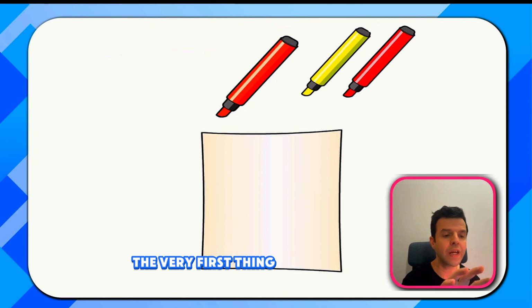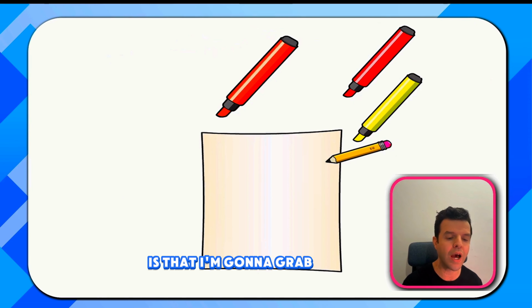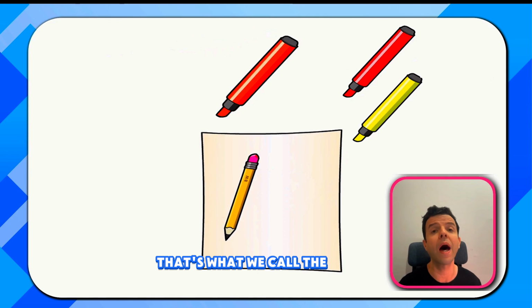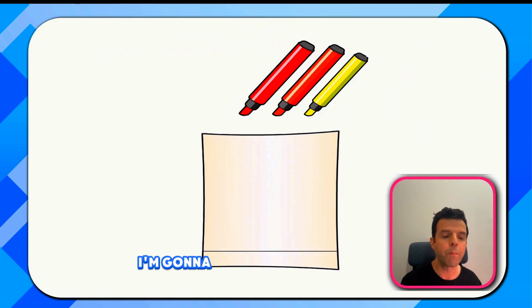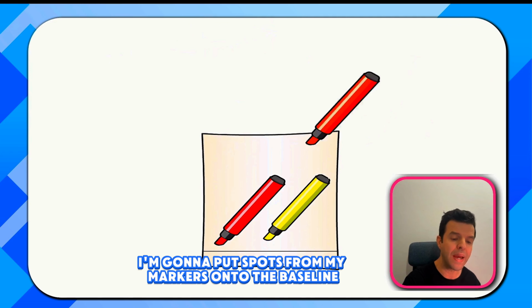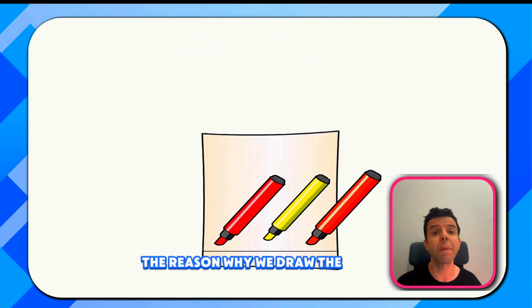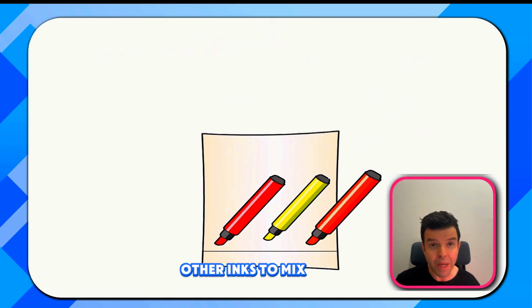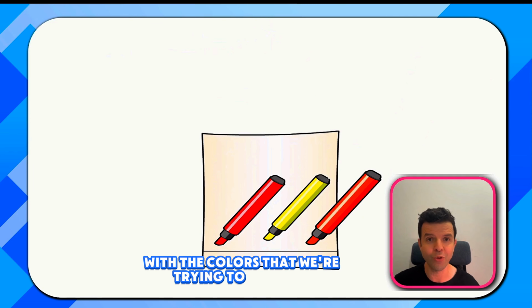The very first thing I'm gonna do here is grab my pencil and draw a line. That's what we call the baseline. Following this, I'm gonna put spots from my markers onto the baseline. The reason why we draw the baseline with the pencil is just because we don't want other inks to mix with the colors that we're trying to separate.